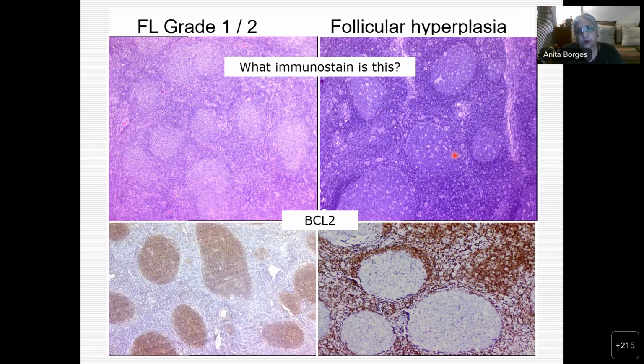Proliferation and apoptosis are going on inside that center. So you get, as I showed you in the Ki67 stain a little while ago, upwards of 90%, sometimes, maybe upwards of 80%, but you will find a very high proliferation index.